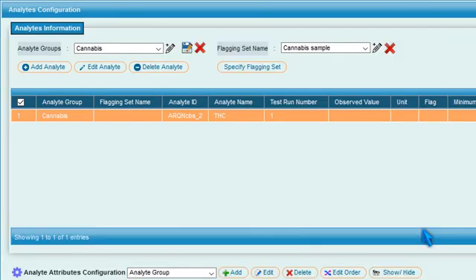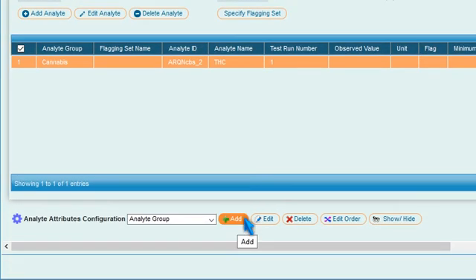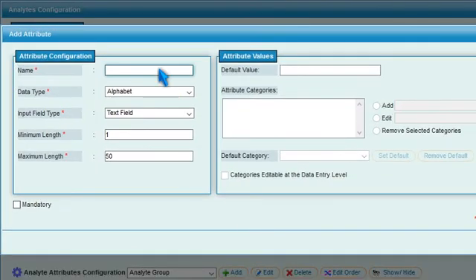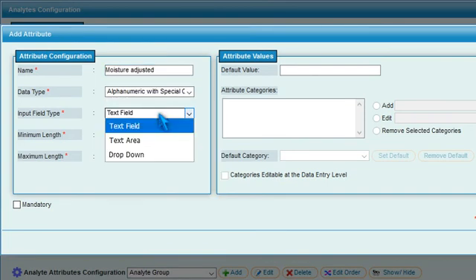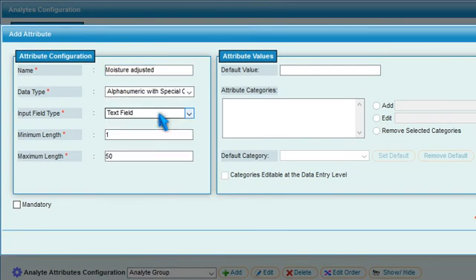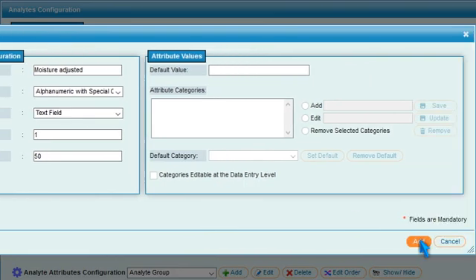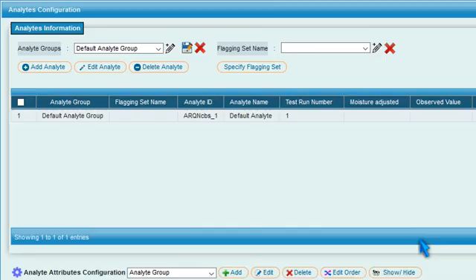To add an analyte attribute, press Add and specify details such as name, data type, input field type, etc. Press Add to save the attribute.